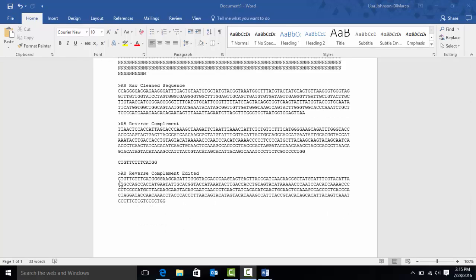If you're unable to locate the CTG sequence in your sequence, and if you have a lot of Ns in the beginning of your sequence, you may have what is called a homopolymer sequence. And what you want to try to do is locate that. So that particular sequence is preceded by 4 A's, and then it is a string of C's. So in this case we have a C, C, C, C. We've got a T in the middle. And someone who has a homopolymer sequence, that would be an additional C. And then we're ending up with 4 more C's after that.